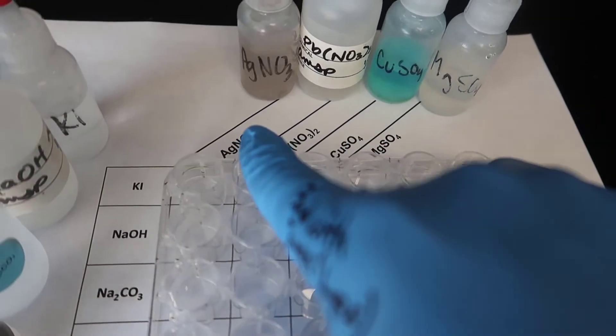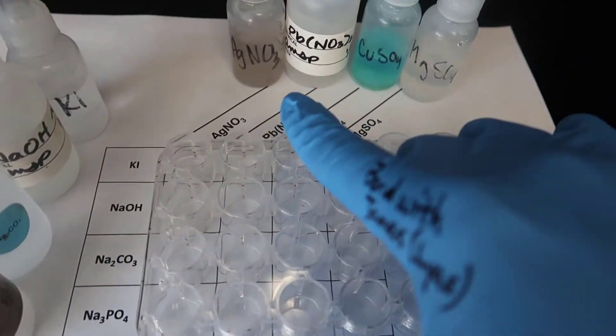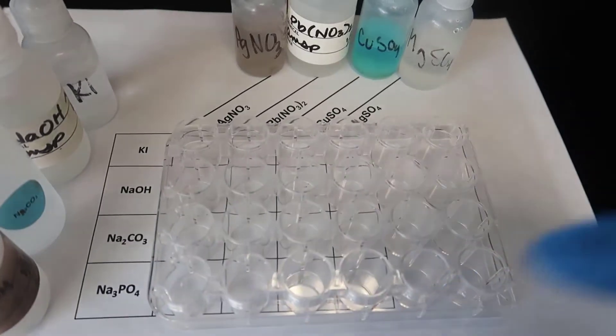And then two drops of AgNO3, since this is the first column, two drops here, two drops here, all the way down. Same thing with the PbNO32, two drops here, all the way down.